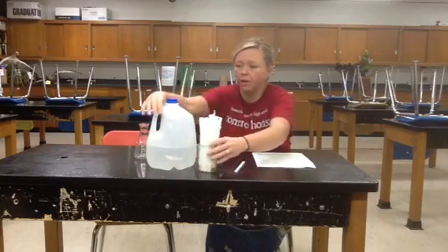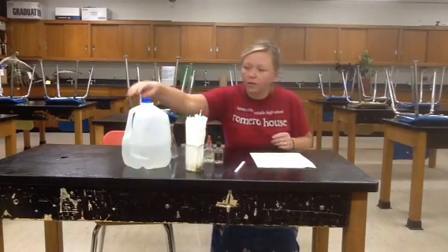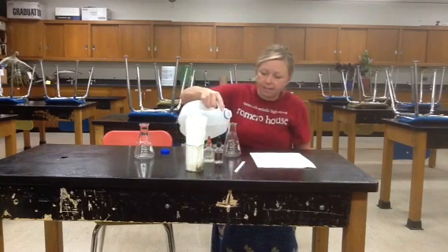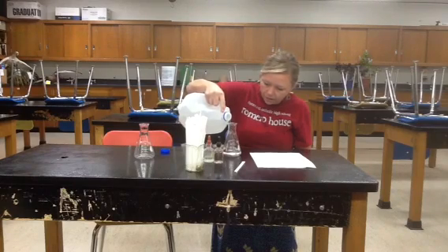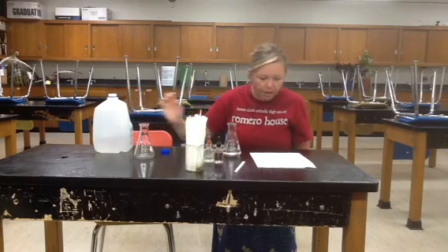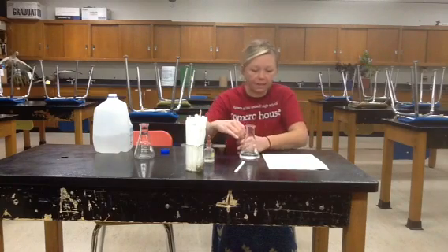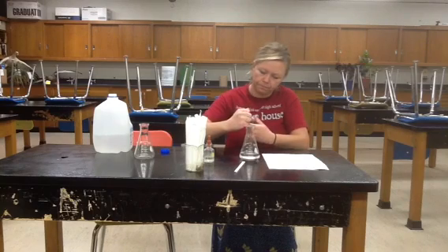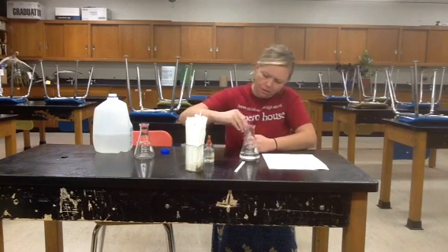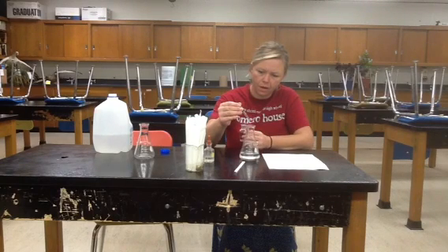So for the procedure, you're going to pour 100 milliliters of distilled water into 1 flask. It doesn't have to be exact. It can be approximate. Okay, you're going to add 10 drops of phenolphthalein from the dropper bottle. Four, 5, 6, 7, 8, 9, 10.